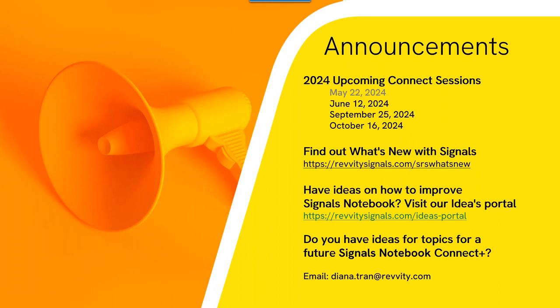I believe we can definitely get back to you on that. I'll need to follow up with the product manager from the notebook standpoint on taking written notes and pulling that into the notebook. If that is not the question, let me see if I interpret it a different way: handwriting data and then AI and machine learning. I'm not sure how that would connect in another way. So that's how I would answer it for now, but let me know if I'm missing your point or the why behind the question.